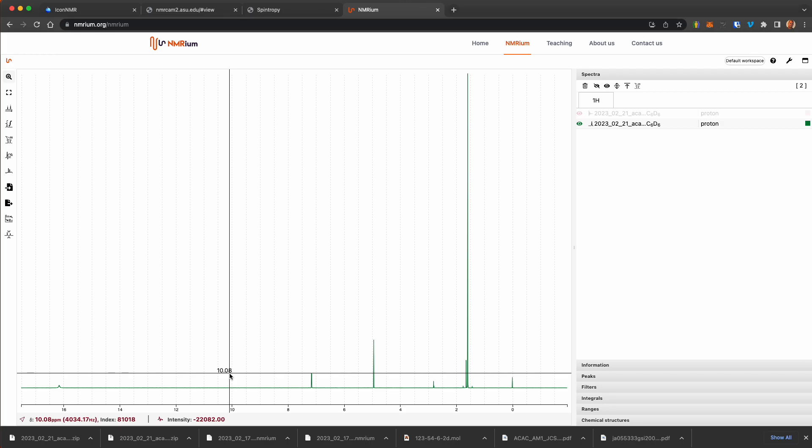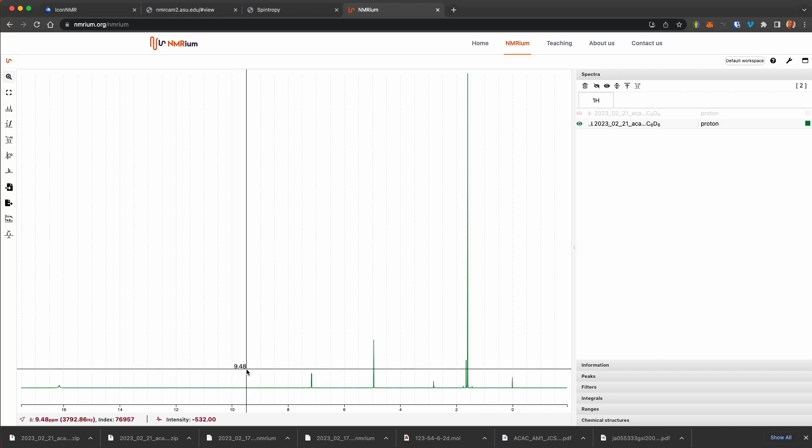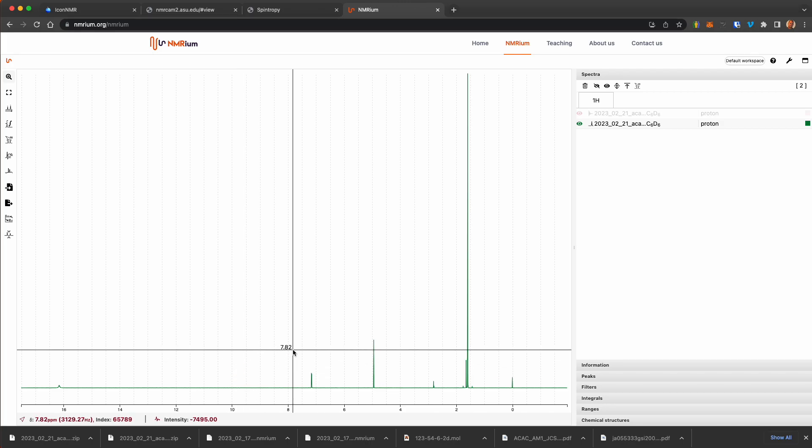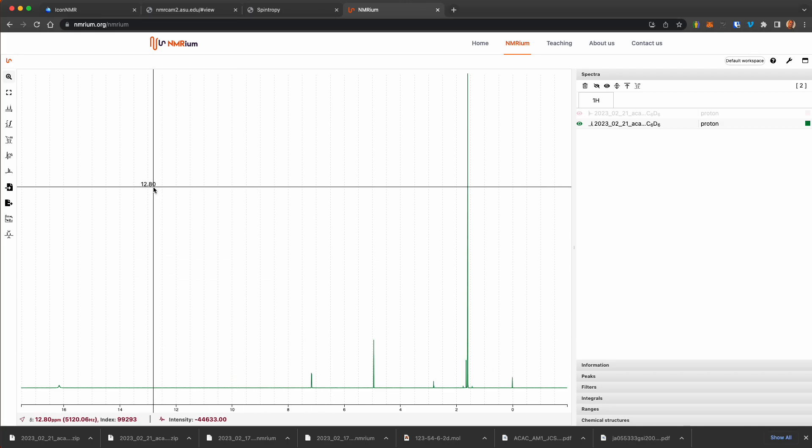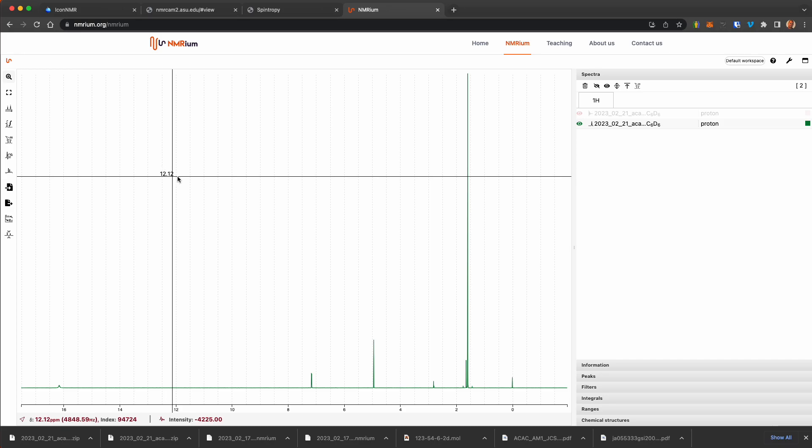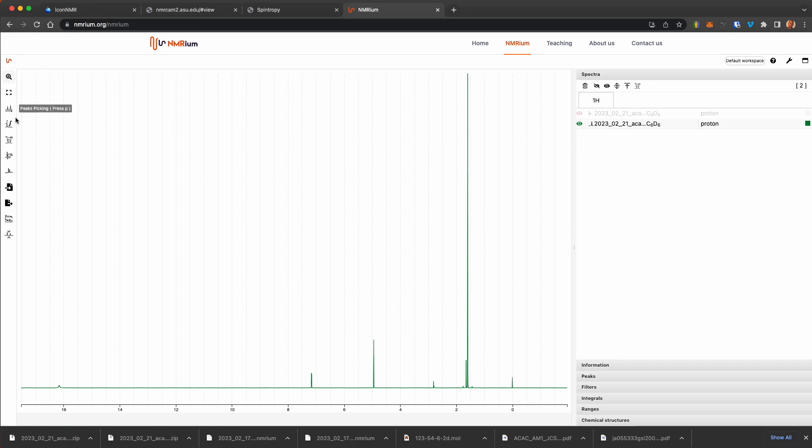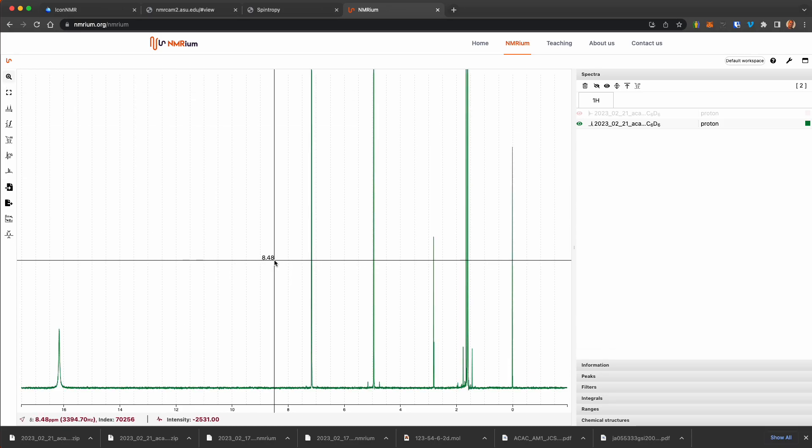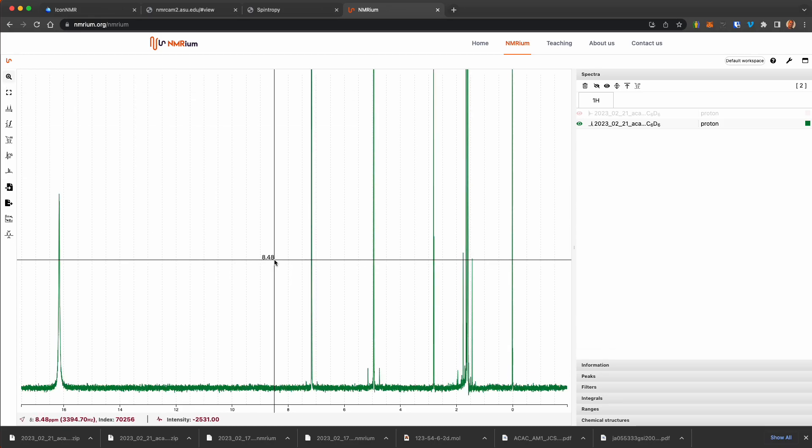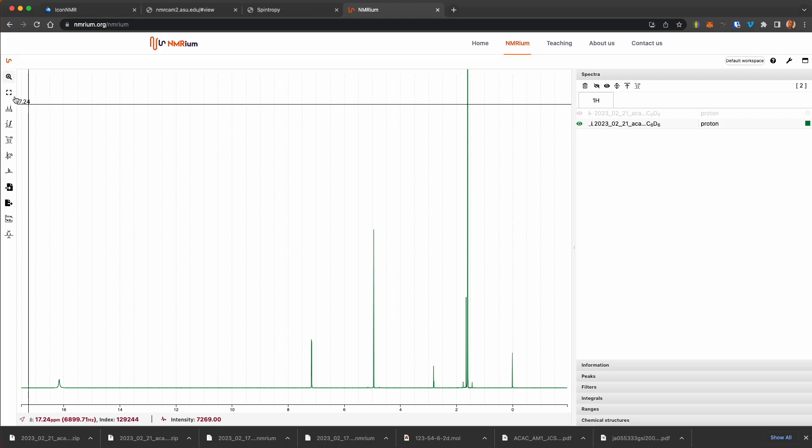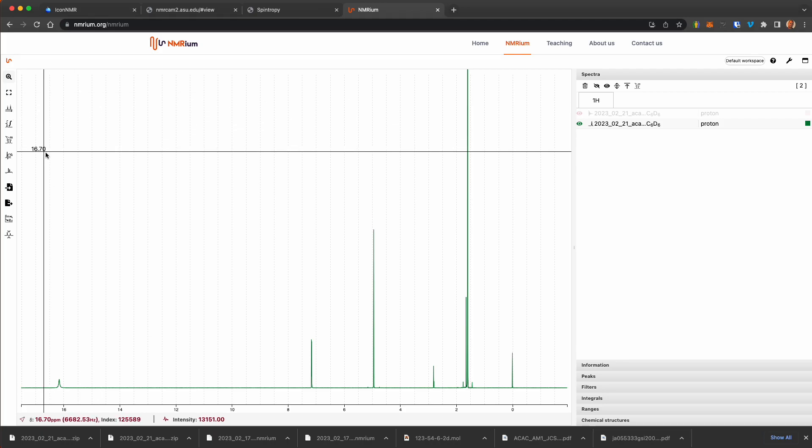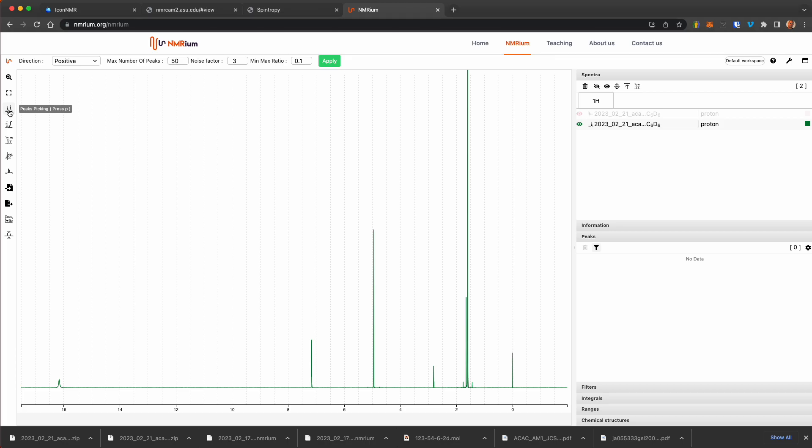Let's look at doing some quick analysis of this in NMRium. So going through here, we can see we can blow up the spectra. We can highlight certain regions. Let's start with peak picking.